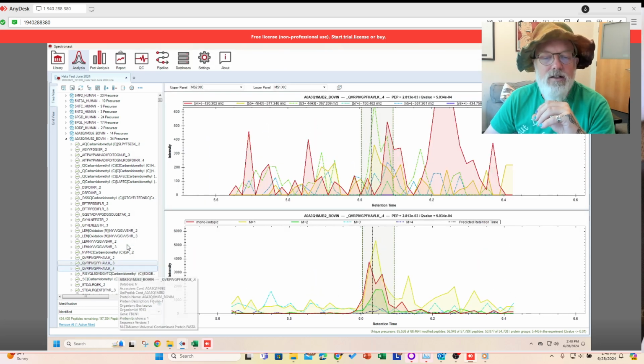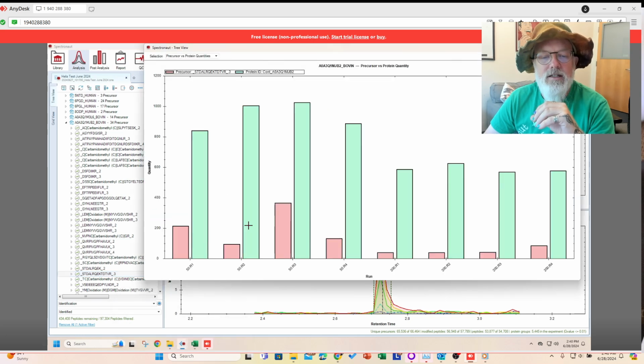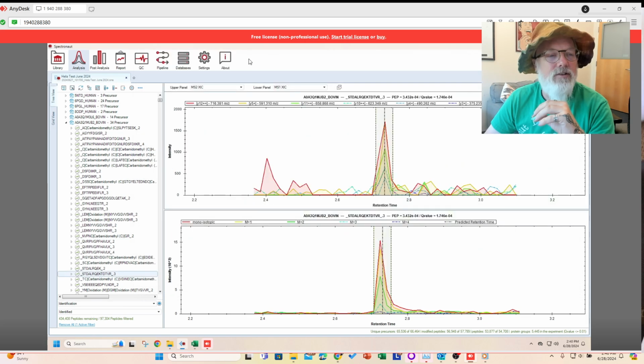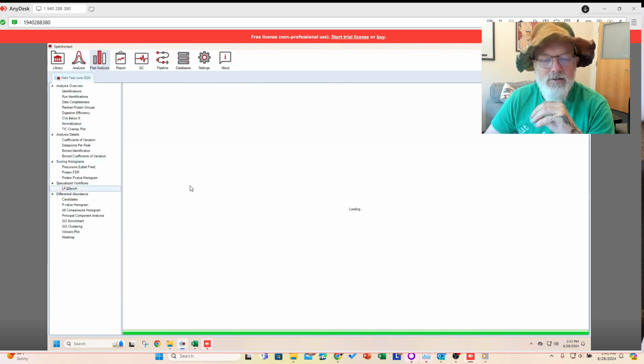Let's see. Okay, so you can see it kind of looks like it over normalized it, so it looks like there's more signal in the 50s than in the 200s. So that's not great. And another thing we want to look at is the LFQ bench, which sometimes works.